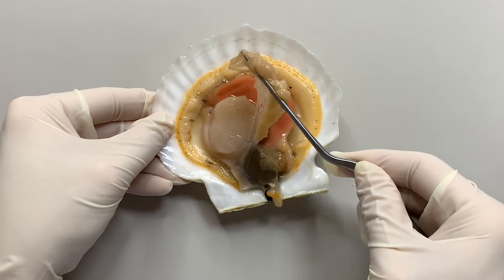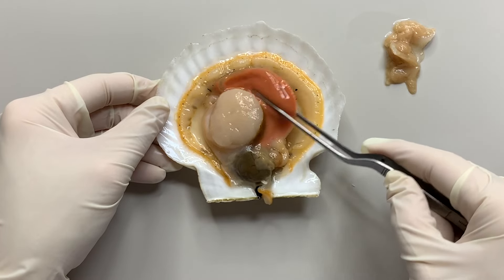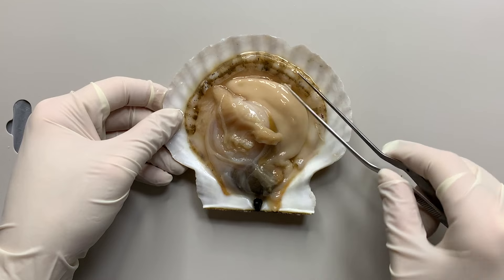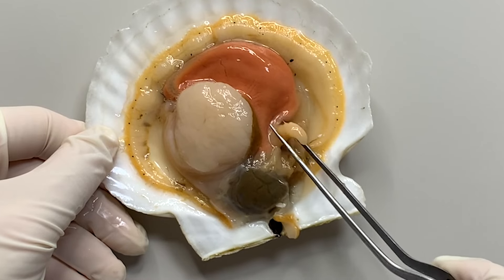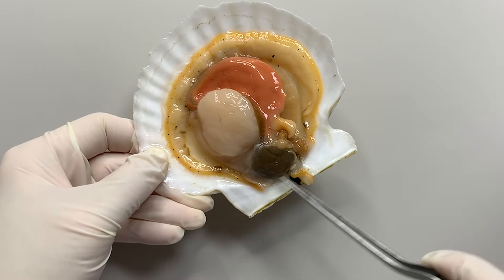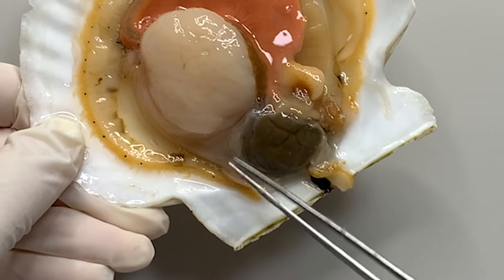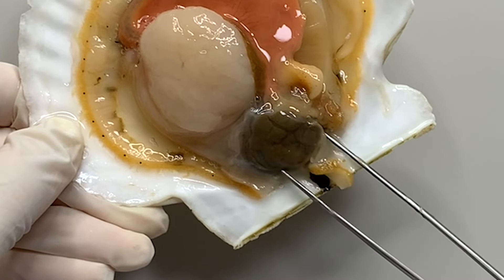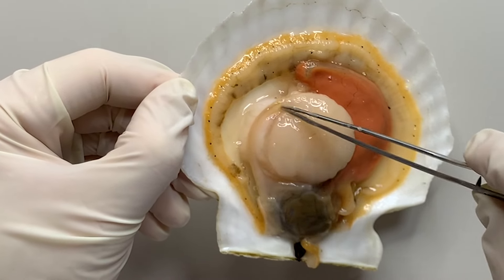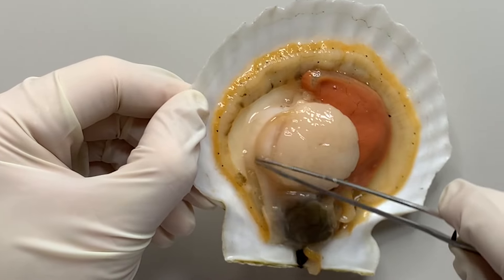If you remove the gills, what you see is the scallop's gonads. If it's red, it's the female gonads, and the male has white ones like this. And they have a mouth right here. The digestive organs are located behind the mouth — digestive glands, esophagus, stomach, and intestines are all in this area. The scallop's intestine leads to the side of the adductor muscle, where the scallop's anus is located at the end.